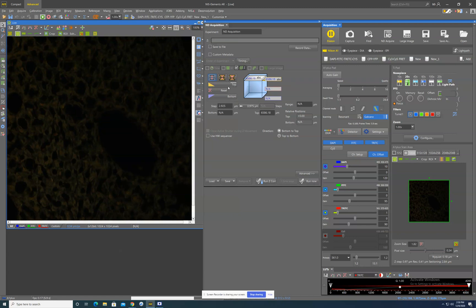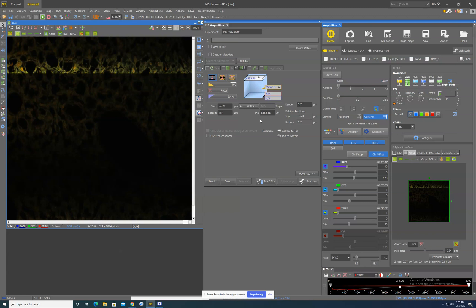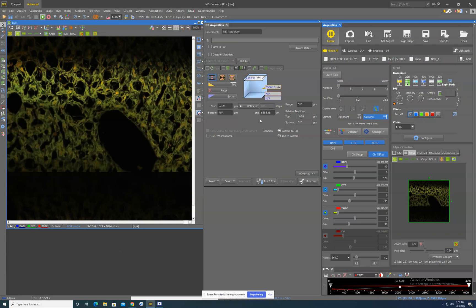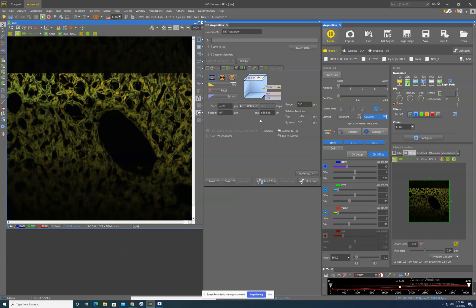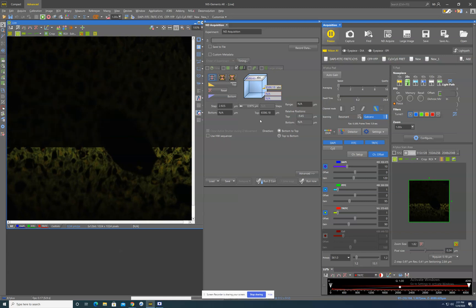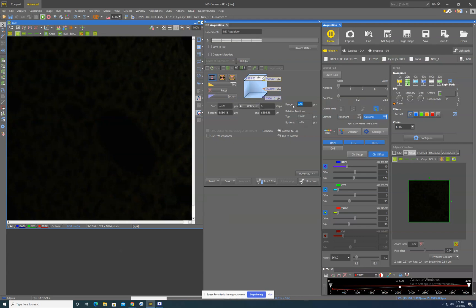So now that I've defined the top, I'm going to adjust the focus back through the depth of the sample until I get to the other way. It's going to get brighter as it's coming into focus and dimmer as it's going out of focus. And we'll say, I don't care about anything beyond this point. So I define this as my bottom. And this gives me a range of about 9.45 microns. That's pretty normal. Anywhere between five and twelve is probably going to be pretty normal for what people are doing.